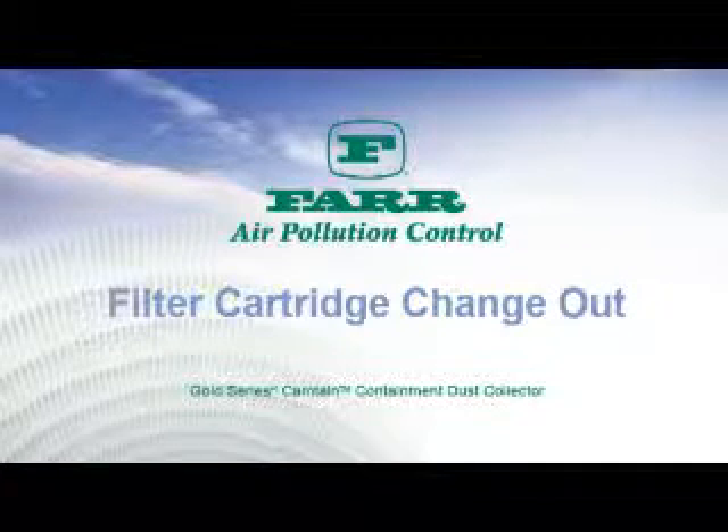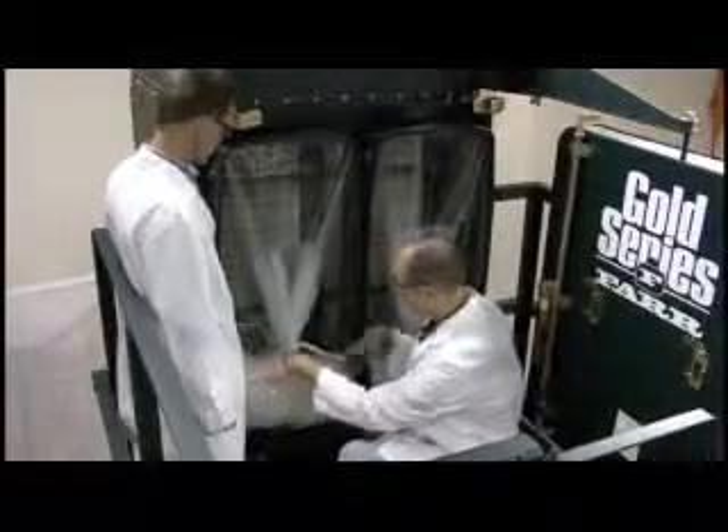Filter cartridge change out. Open the Davin arm doors and swing off to the side, ensuring you have full access to the filter cartridge openings.